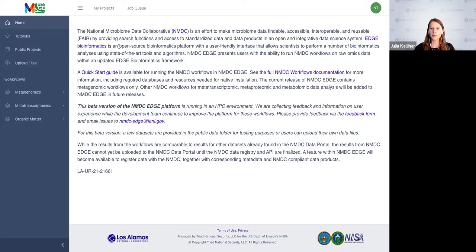This homepage has links to different things that you might be interested in. There's the EDGE bioinformatics link, a quick start guide, a link to the documentation, and more information about beta testing as well. If you come here, you can get to our feedback form and our support email as well.